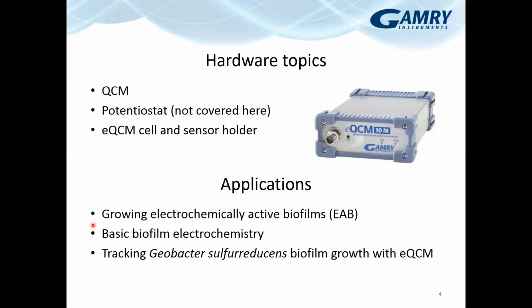And that is on how to actually grow the biofilm, the EABs, in the QCM cell, as well as how to analyze them, or at least run some basic electrochemistry. And then we'll finish up with looking at how we correlate the electrochemical results with the QCM data.